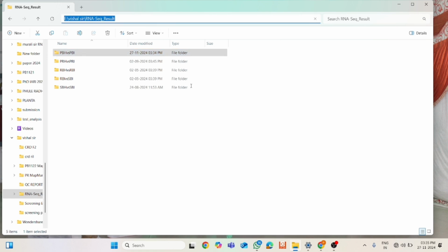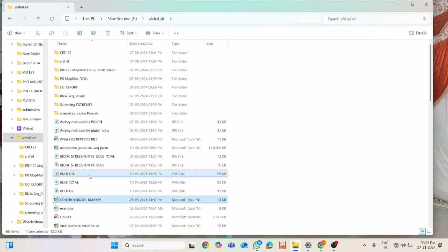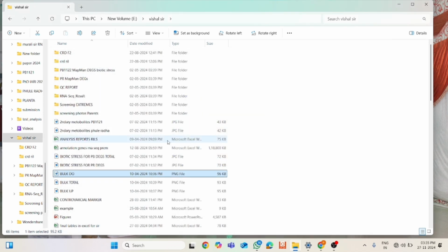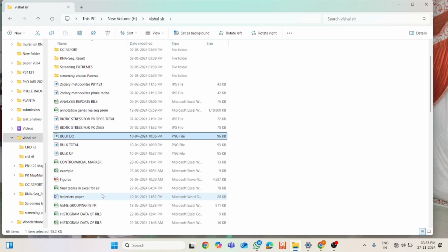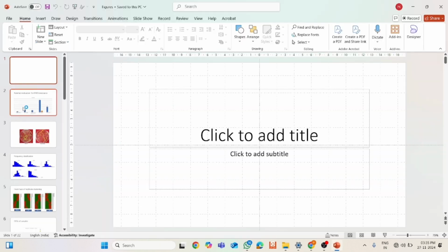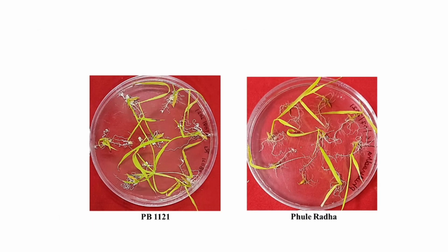I will show another analysis that I have done. Yeah, here you can see that. First you have to compare how many genes were common between susceptible bulk versus susceptible infected, and I will show the one day. First you have to compare overall genes. I will show you actually. And please don't take screenshots, it's unpublished data.